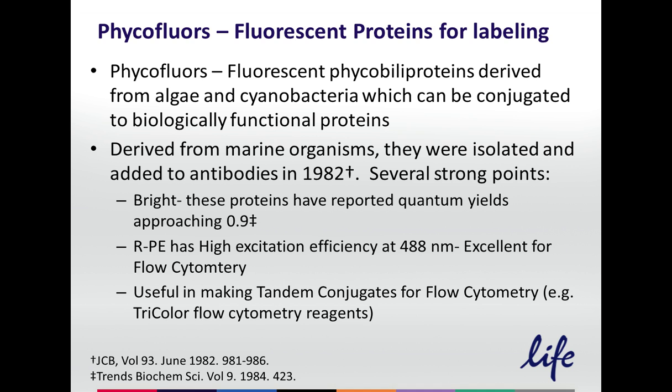These really came to light in the early 80s and caught on very quickly. They're very bright. They have quantum yields up at about 90%. They can be excited at one wavelength and detected at a much higher wavelength, so they have a very big Stokes shift that I talked about earlier.